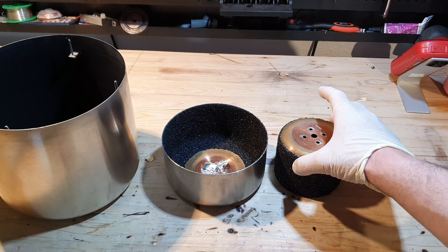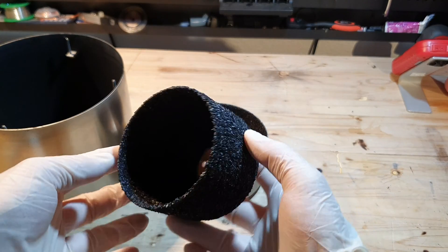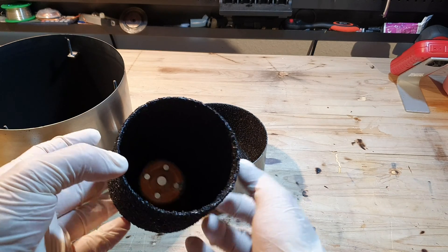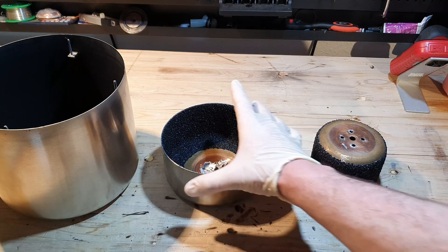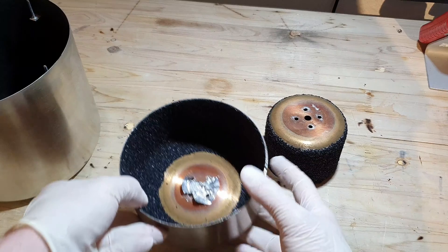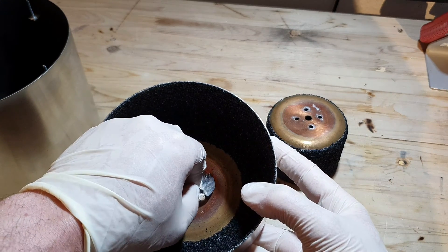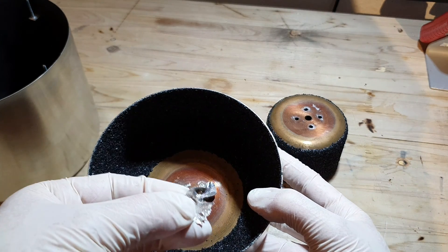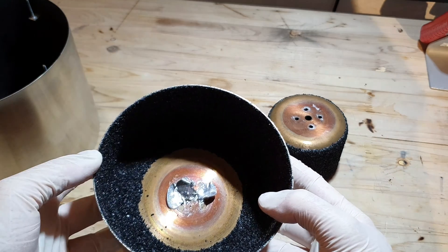Here you can see the internals of the pump. All of these surfaces are coated with activated carbon to aid the adsorption of molecules. When I make the video about the vacuum system I will build, I will explain in detail how these pumps work. To optimize the heat transfer, all of the metal to metal contact points were aligned with indium foil. It's comparable to a thermal compound you would use when installing a heatsink to a CPU.